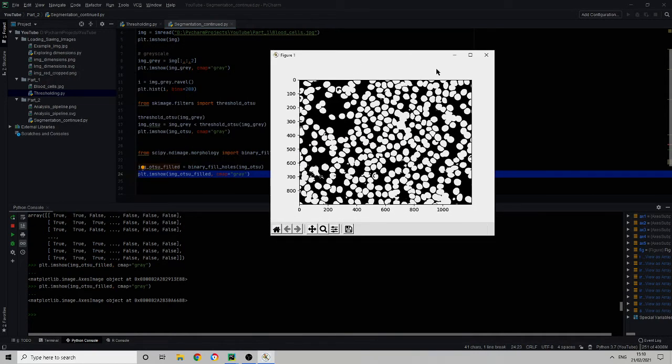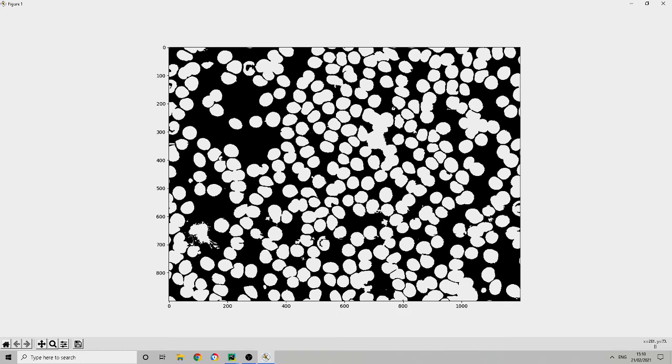So wherever we have pixels that equate to 1, what happens with a dilation is they just expand. So each object gets a little bigger. And what we hope will happen when we do that is that this gap between the two sides of the cell will connect. So then we have a donut shape. But the problem of just doing a dilation is that it will cause cells to become bigger. They will dilate, and that will influence when we measure the size of the cell.